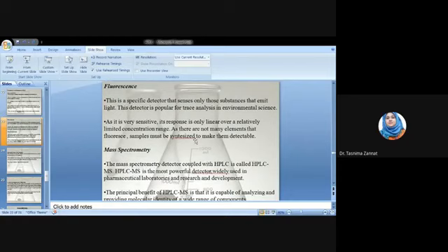Now the fluorescence detector is very limited use, because the components which have only the fluorescence property like zinc sulfide or like cadmium sulfide, যেগুলো fluorescence property আছে শুধু ওগুলাই এটার মাধ্যমে ডিটেক্ট করা যায়, so it is also very limited use.